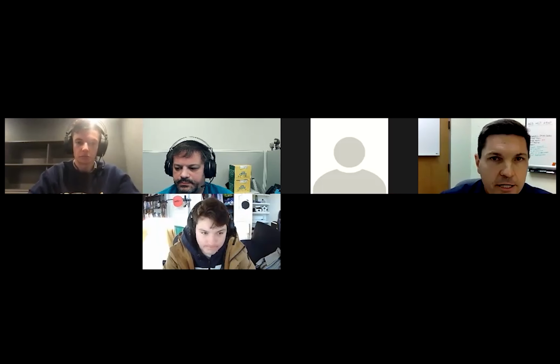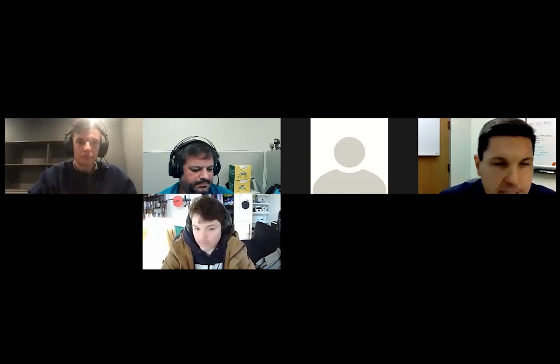Great. And I have a question here from Jen Vanderklen. What is the exact volume, especially for Ryan, that you're using for direct extraction? Yeah, so we've modified a Zymo kit a little bit. As I mentioned, we mix the sample with the RNA Shield stabilization or preservative, and we also use that as the lysis buffer. So we don't add additional lysis buffer, but the volume that we're collecting is 250 microliters. And the other reagents in that kit are scaled up accordingly.